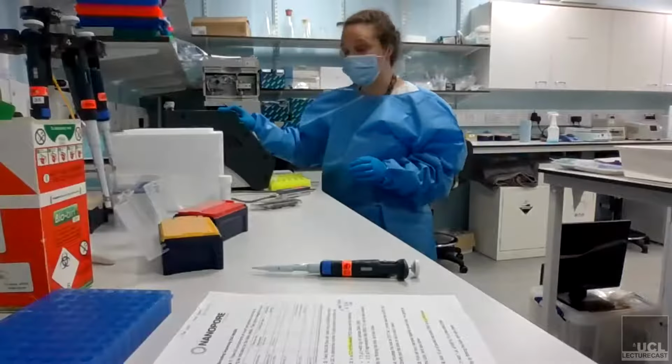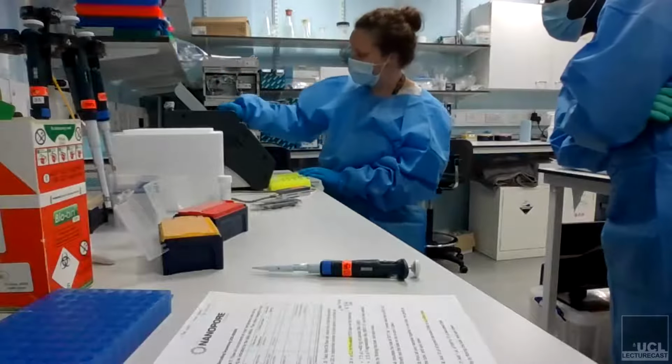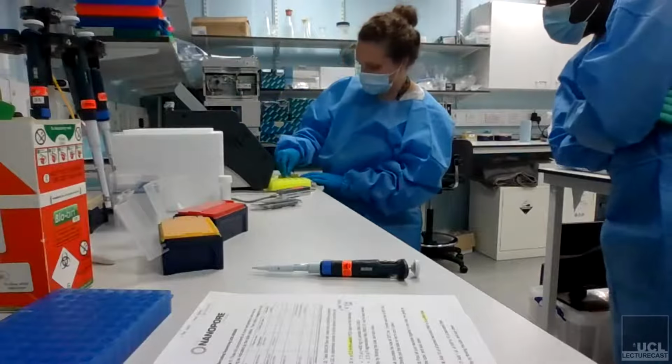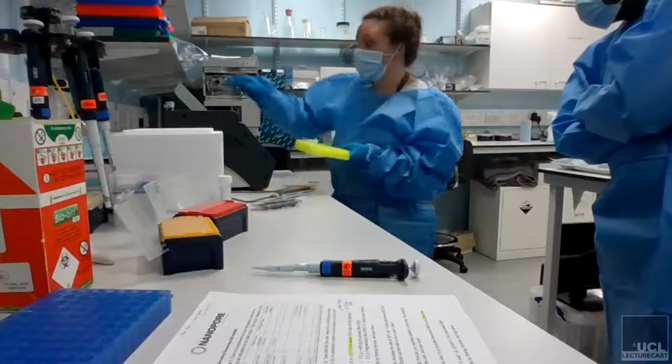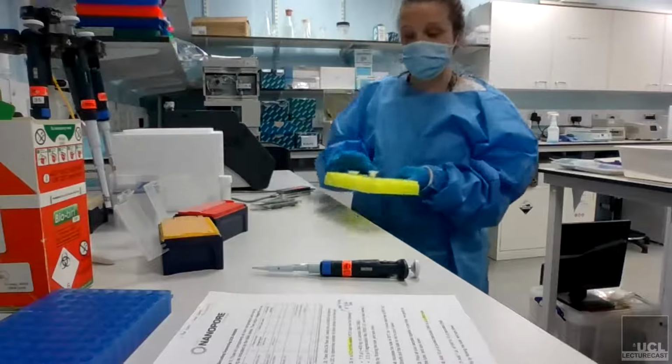Thank you. Whilst we've been chatting, our PCR has probably finished, so I will take our samples out. Let's put that back. For this protocol, that's the only time you'll need the heat block or the PCR machine.